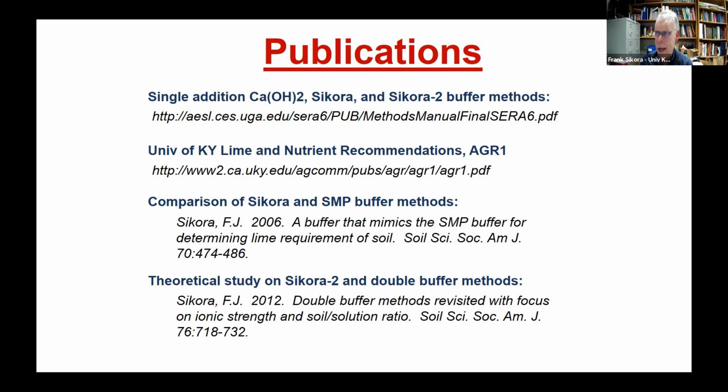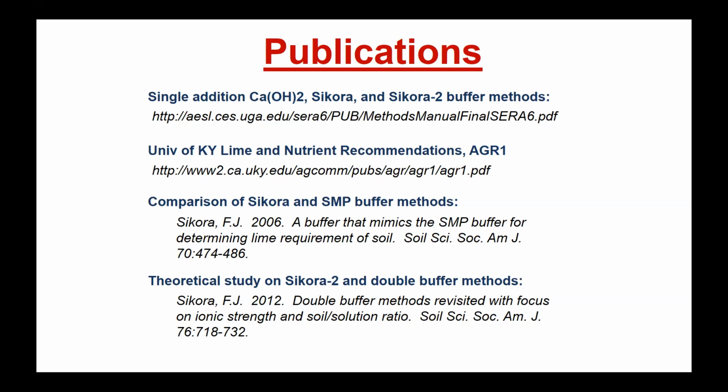I just looked at mimicking, creating the same buffer pH. And to tell you the truth, I'm forgetting what the ionic strength is in the AE buffer. Yeah, that's what I was wondering too. I know you have added KCl here, but I don't know if anything similar happens with AE too.